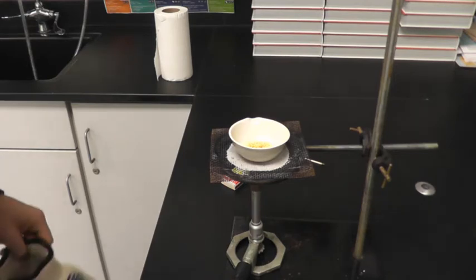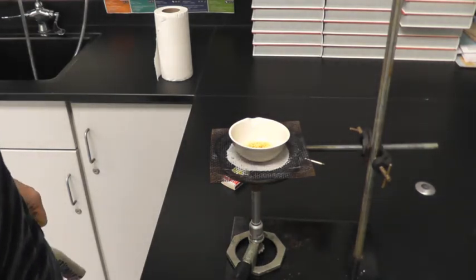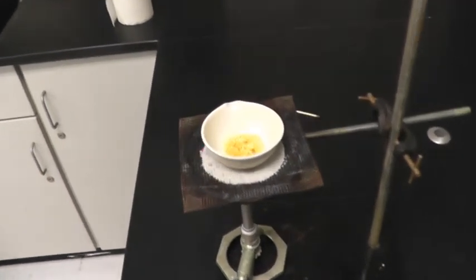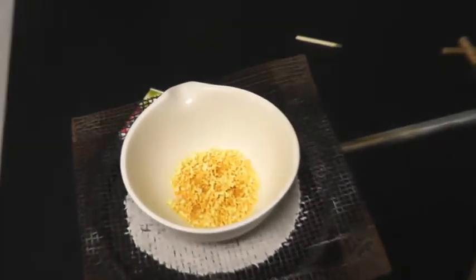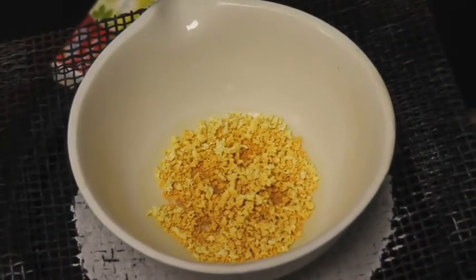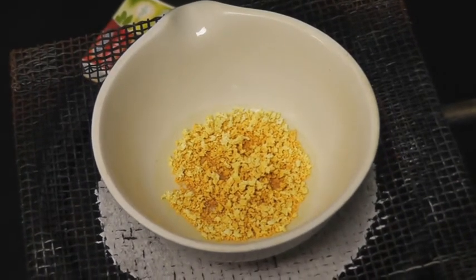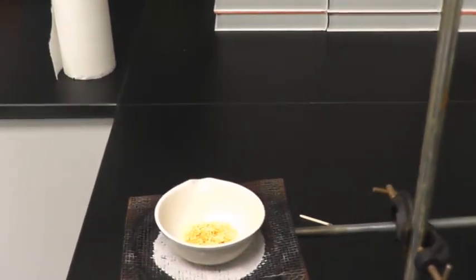Alrighty, so we are back after about 5 minutes of heating. What I'm going to do is turn the gas off, because I don't want to catch the glove on fire. But now you can see kind of what it looks like. It was kind of like that white pasty when it came out of the fume hood, and it had quite that white cover on it when we took it off the hot plate, and now it's kind of this orangish, reddish, I don't know, looks like maybe what Mars would look like or something.